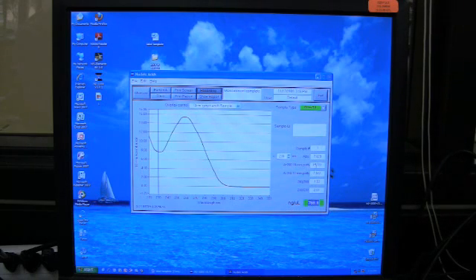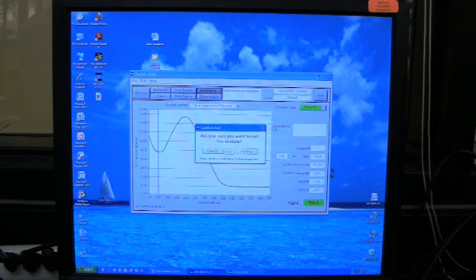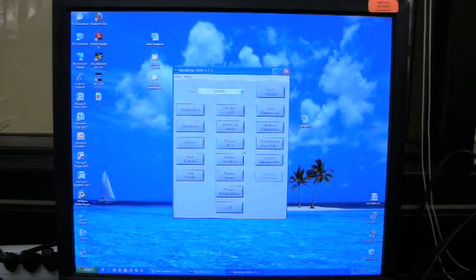If you wish to measure more samples, clean the surfaces of the pedestals, load another sample, and click measure. When you are finished, find the button labeled exit in the upper right-hand corner. This will return the program to the initial interface.